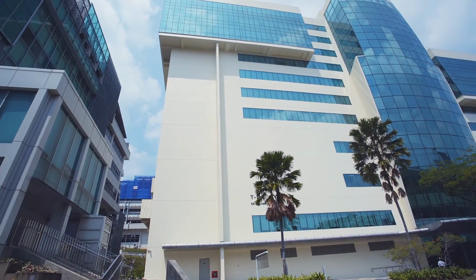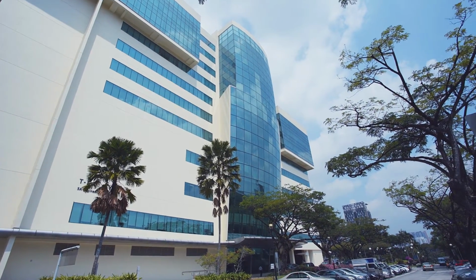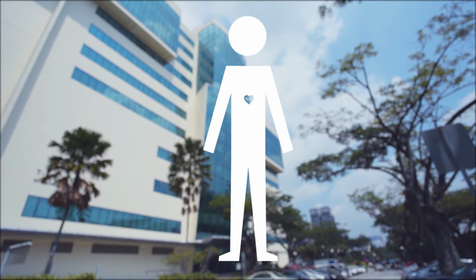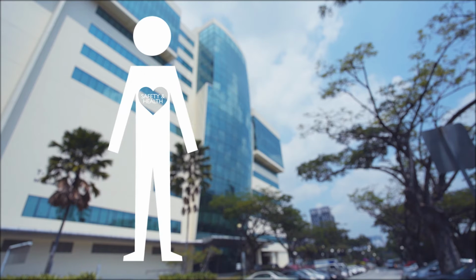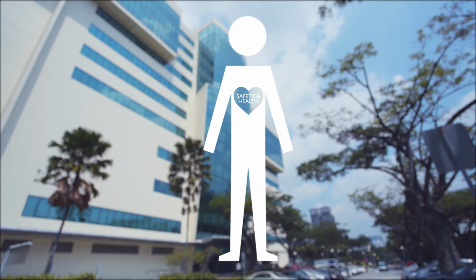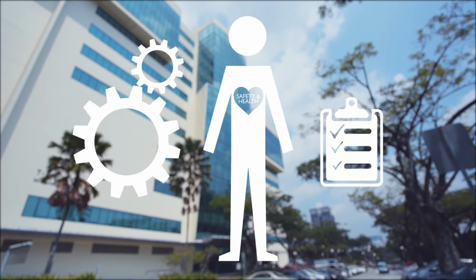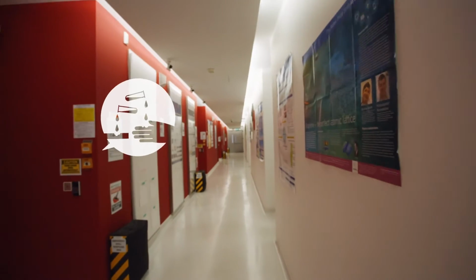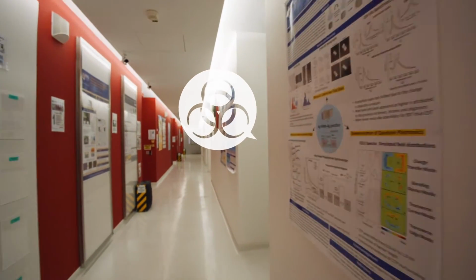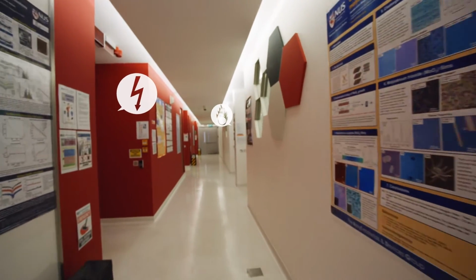In NUS, we embrace safety and health as one of our core values, and therefore, we must all take ownership of safety and to make NUS a safe place to study, work, and live in. That means proactively thinking about safety and following safety rules and practices. This is especially important when you work in the laboratories, where you might be exposed to a diverse range of hazards.